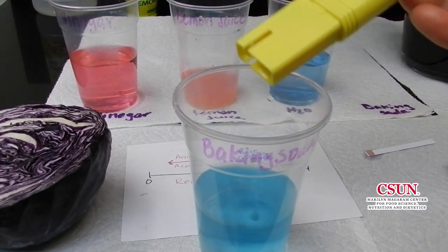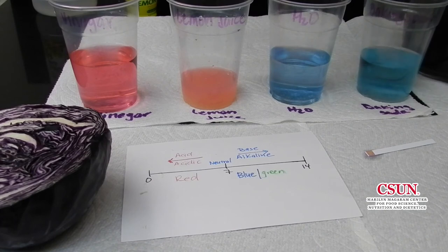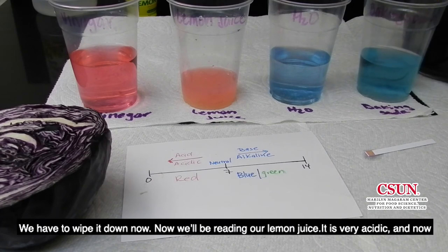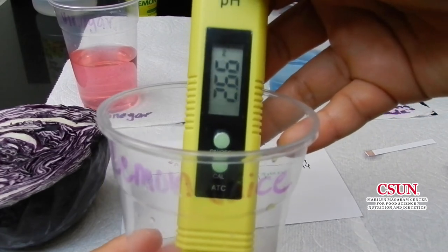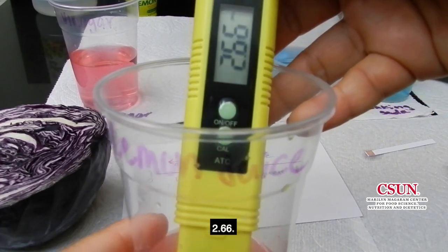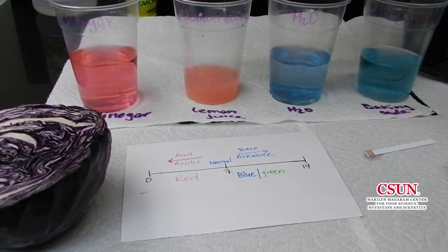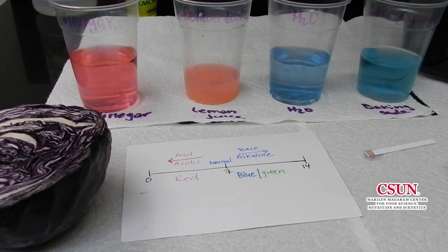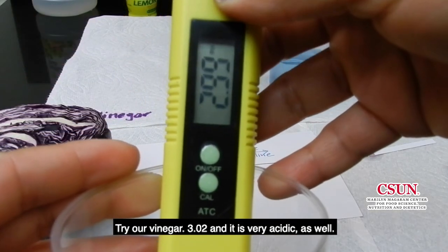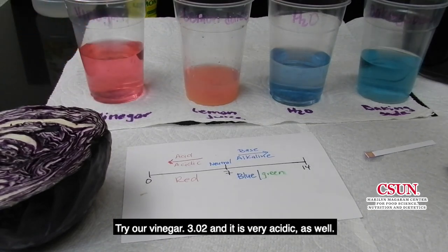Baking soda reads 8.15. We have to wipe it down now. Now we'll be reading our lemon juice — 2.66. It is very acidic. We clean it again to make sure we get an accurate reading. Our vinegar reads 3.02, and it is very acidic as well.